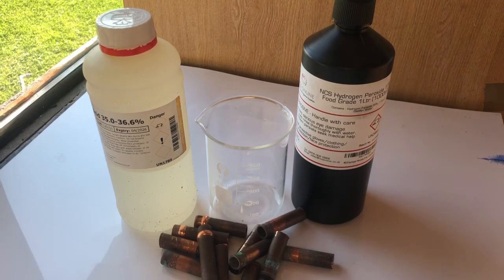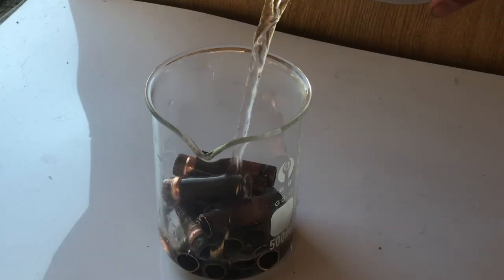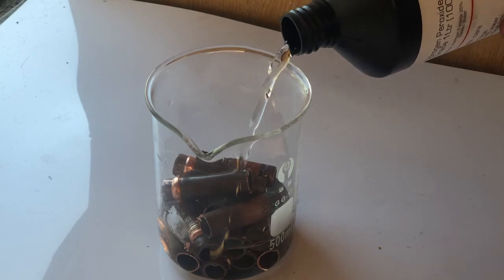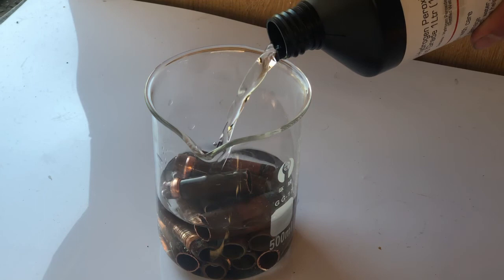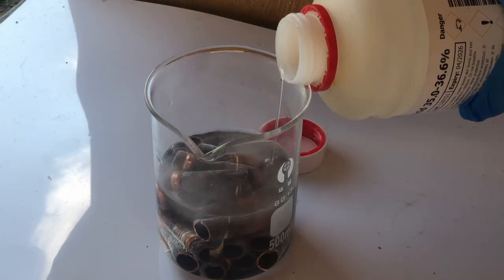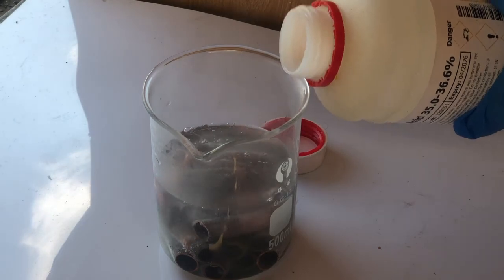In this video I'll be making copper chloride from the reaction of copper metal with hydrochloric acid and hydrogen peroxide. To begin, I put an excess of copper into a beaker and then added 100ml of water. To this I added 200ml of 12% hydrogen peroxide. I then added about 100ml of concentrated hydrochloric acid to the beaker.